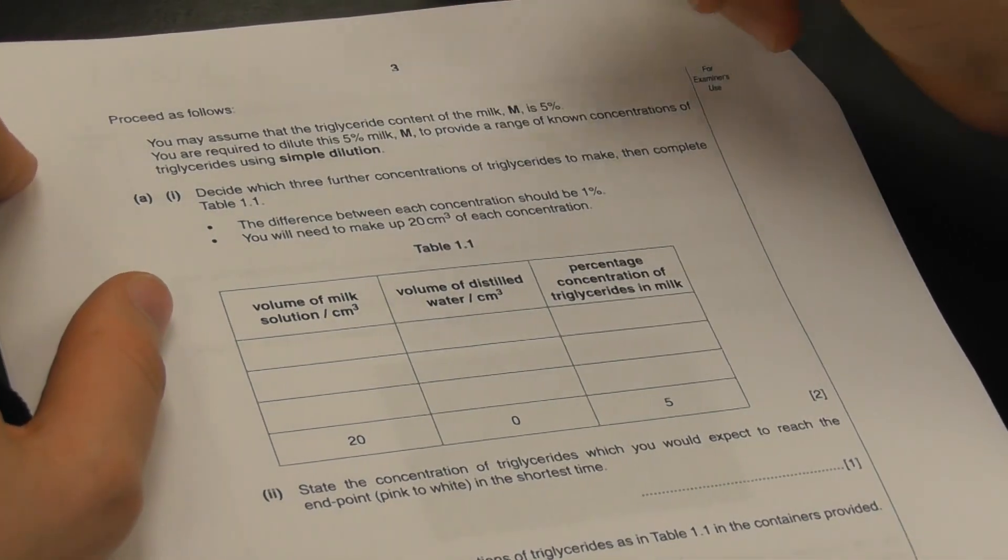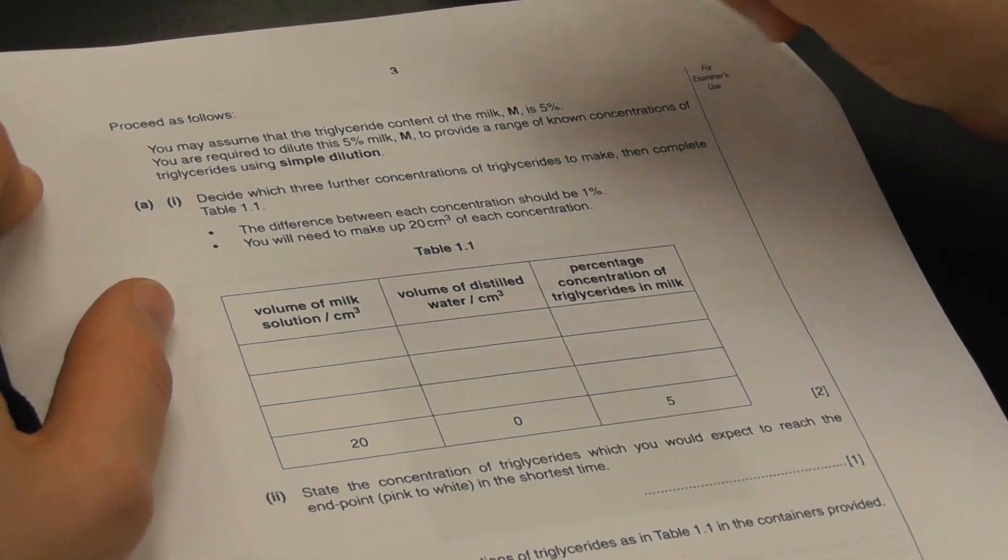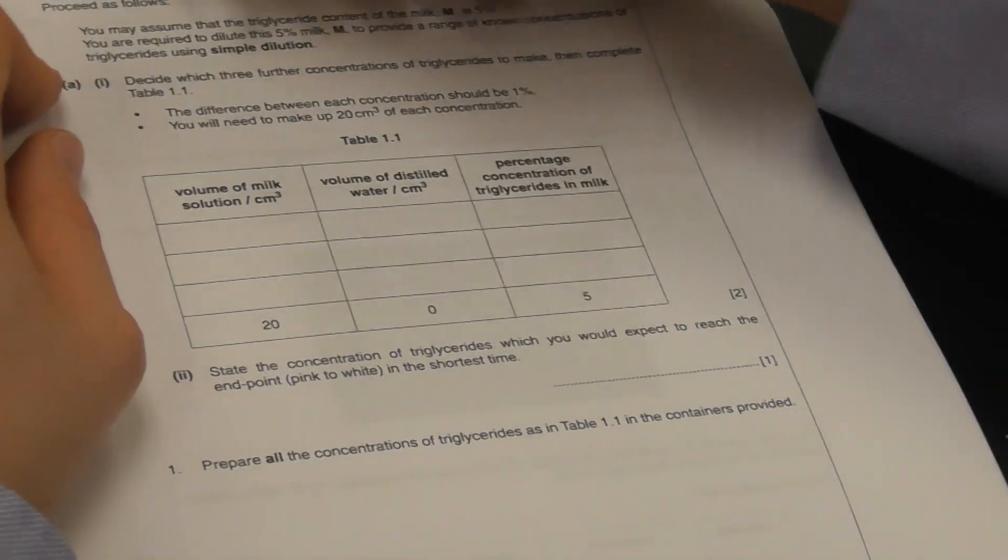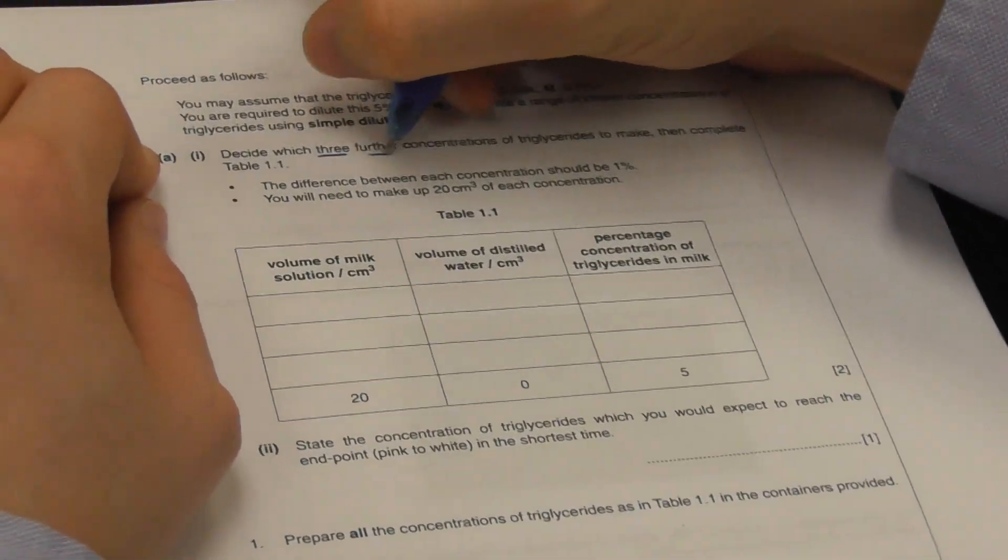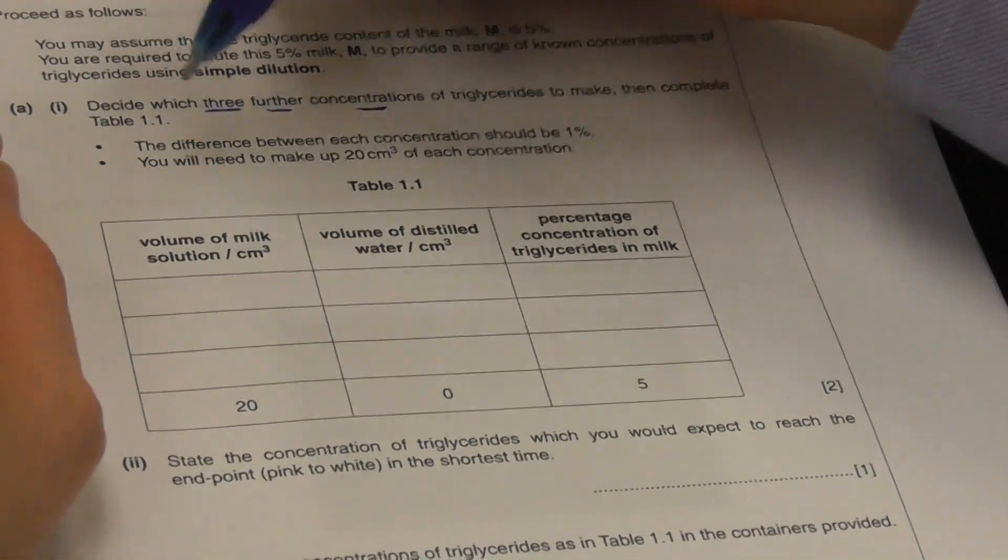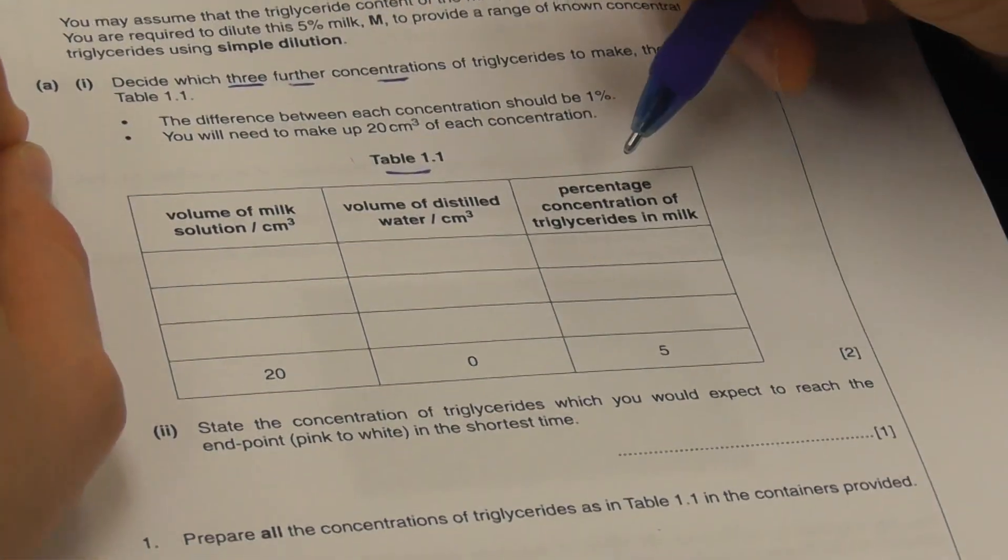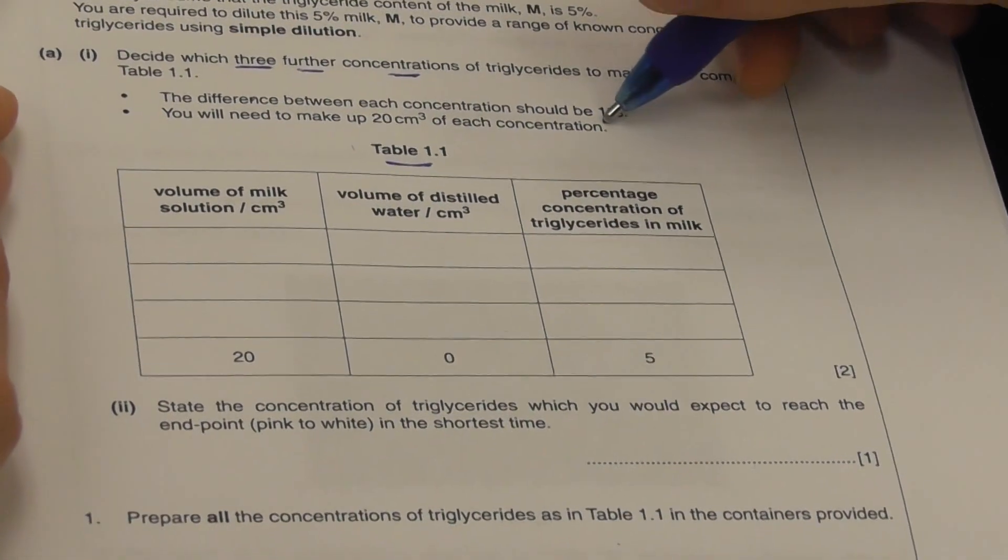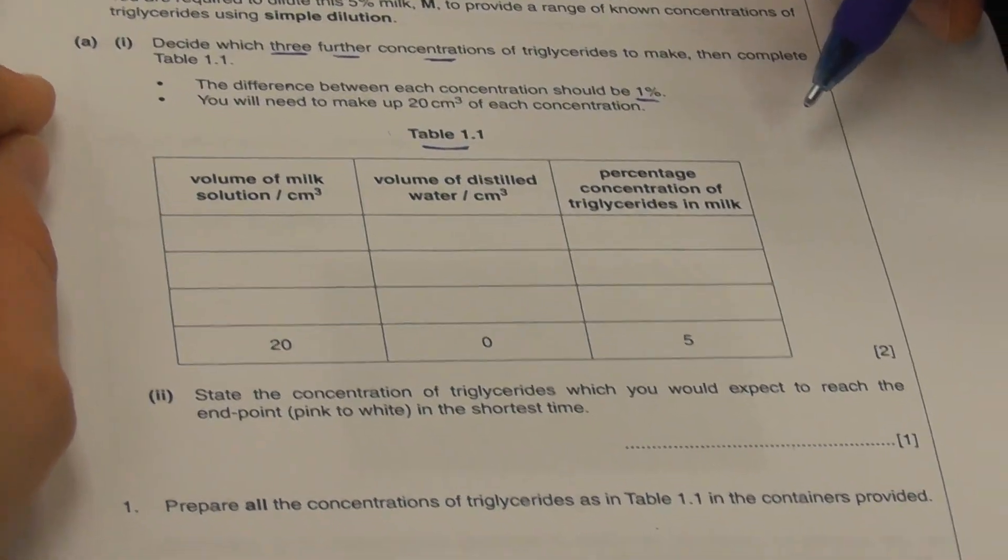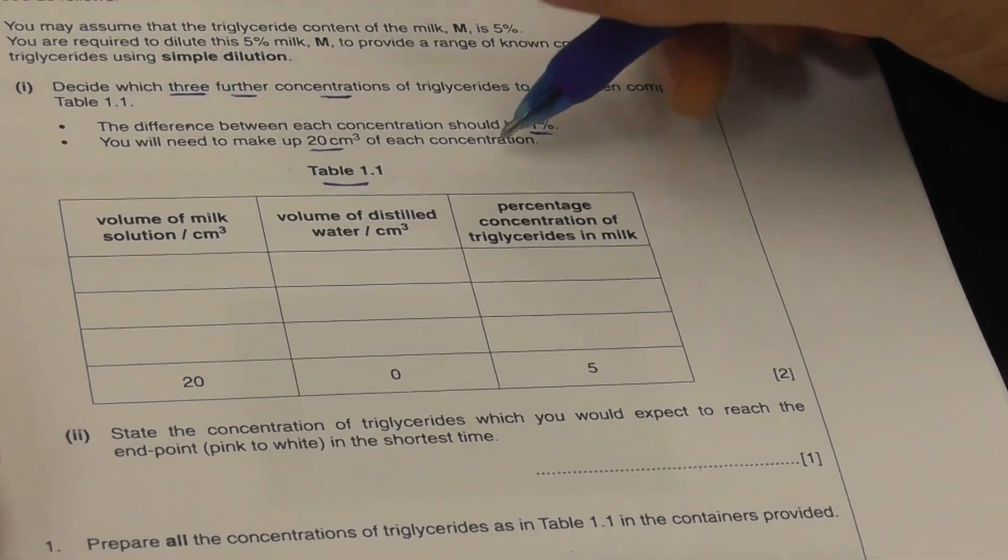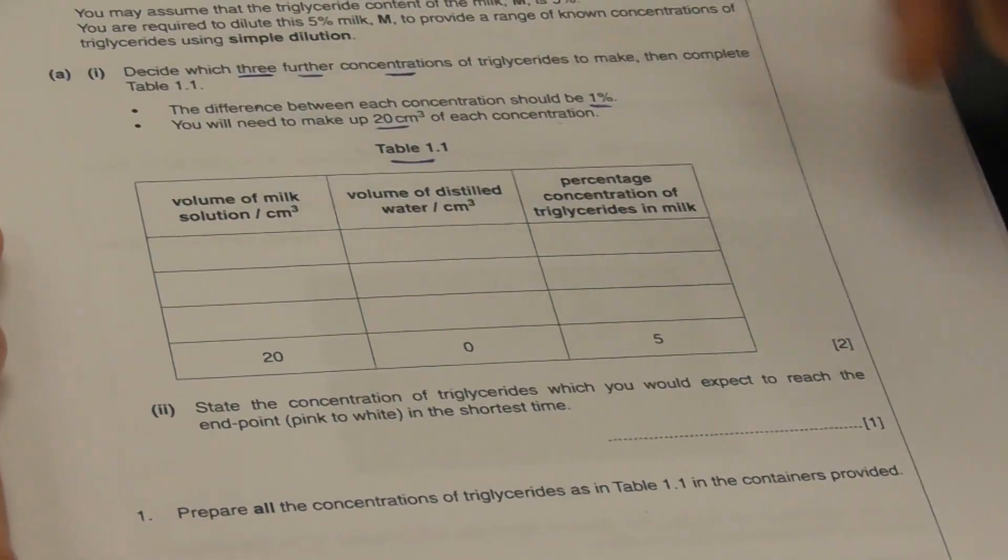We need to dilute 5% milk to provide a range of known concentrations using simple dilution. We need to decide on 3 further concentrations of triglyceride to make, and then complete Table 1.1.